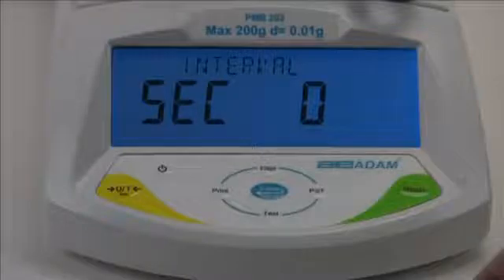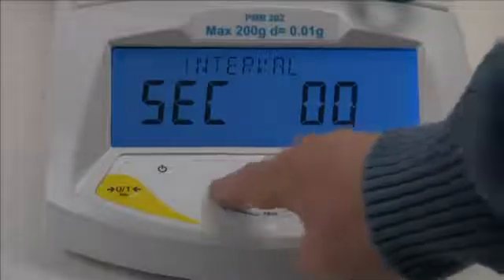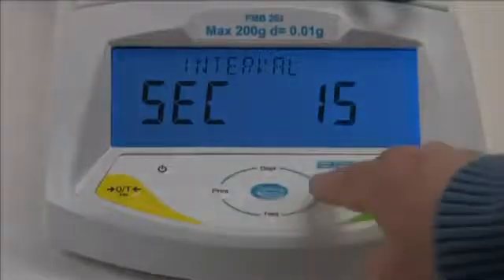Next we need to enter a time interval the analyzer will use to calculate and update results. Enter a value from 1 to 99 seconds. We'll set the interval at 5 seconds, using the arrow keys as before.